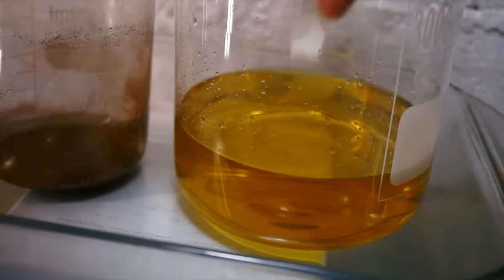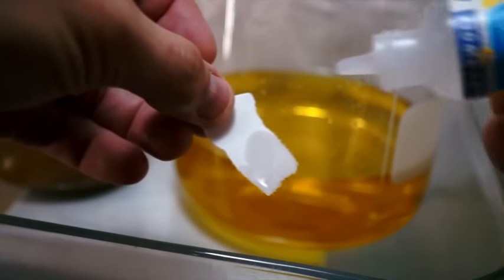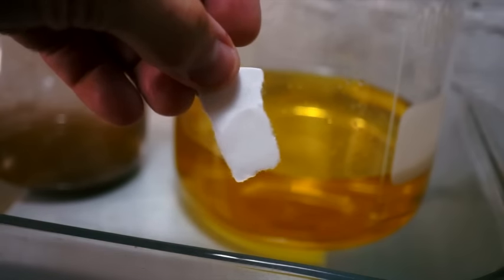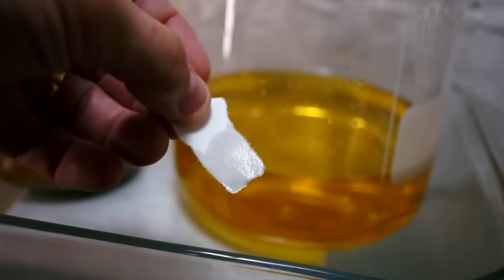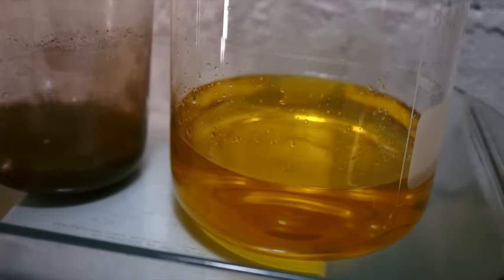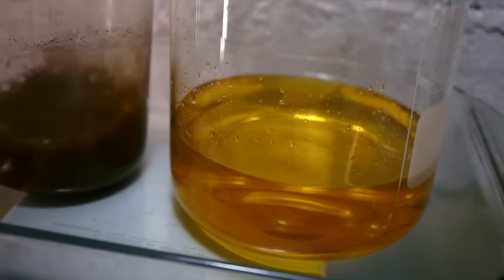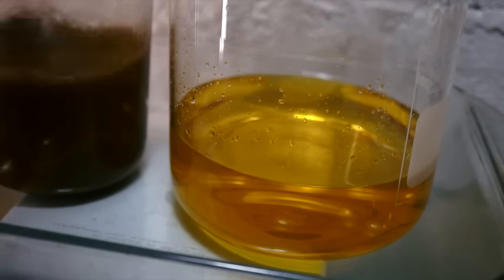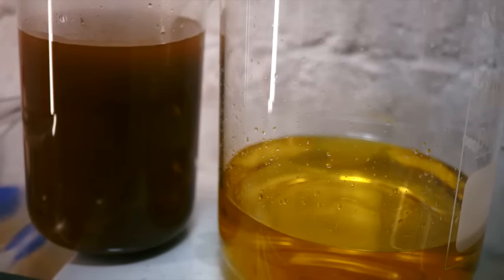A quick test with stannous chloride reveals there is no gold in this solution. We will now rinse the gold with hot water. Once again, allow the gold powder to settle to the bottom of the beaker.